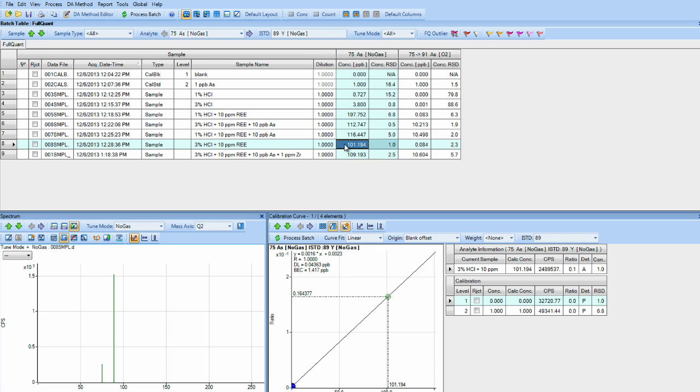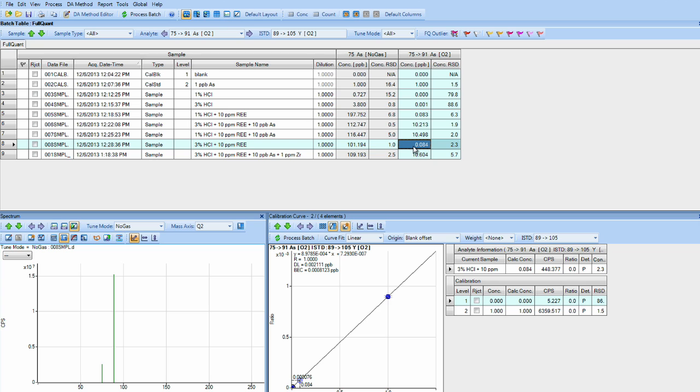In the same sample, but three percent HCl with 10 PPM neodymium and samarium, again, we get about 100 PPB arsenic in the no gas mode. However, we get the exact same amount, 84 PPT, in the 75 to 91 oxygen mass shift mode.